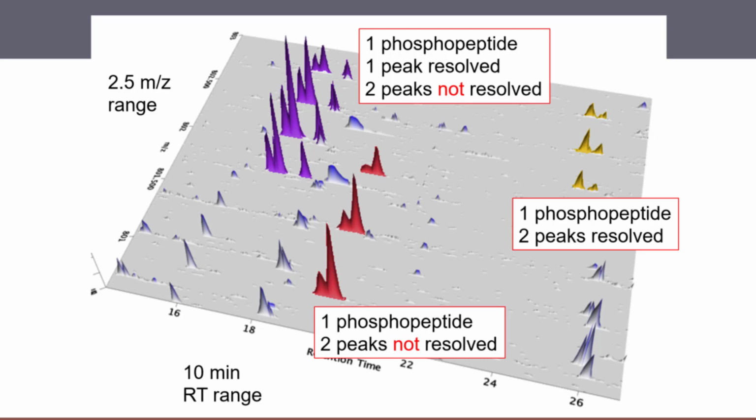The only real benefit we gain here is that we actually collect data across time. And the nice thing is, if you make enough injections of the same sample, as Brian mentioned, you don't get much overlap in sampling the same phosphopeptides. So you eventually start to see all of the different positional isomer forms, but you don't necessarily get them in any one sample.